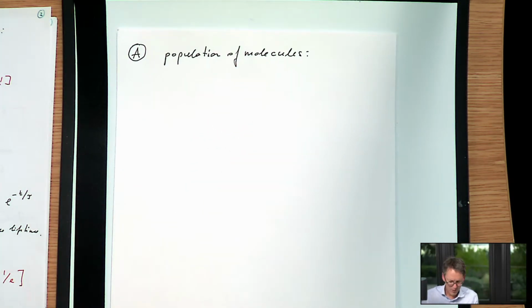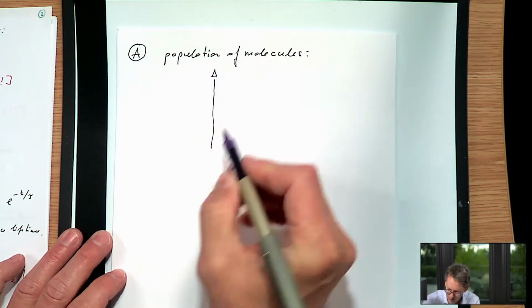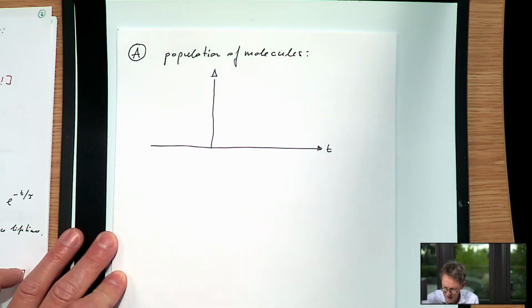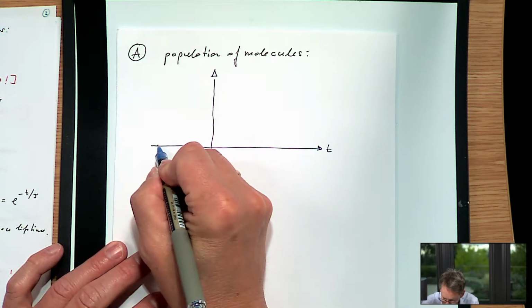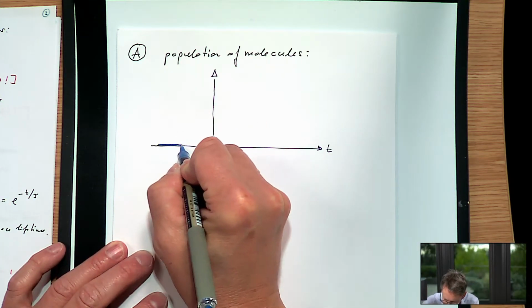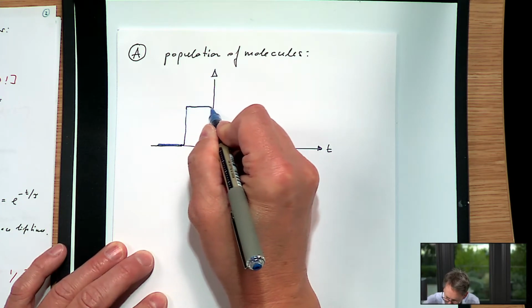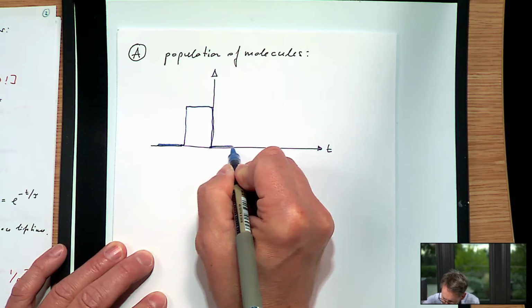And so in this picture now, what I'll do is I draw the same picture as before. I have T here. And now let me draw the excitation as a finite pulse. It's like a rectangle function. And I start this before t equals 0 for this discussion. And I switch the light off at t equals 0.